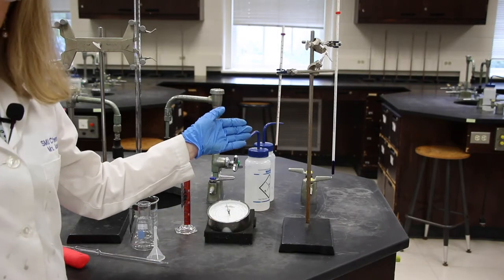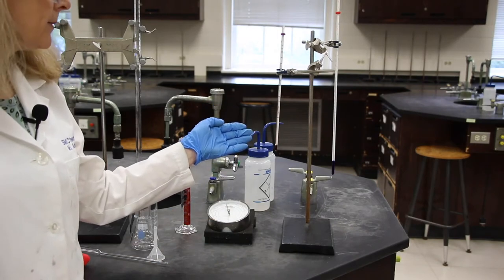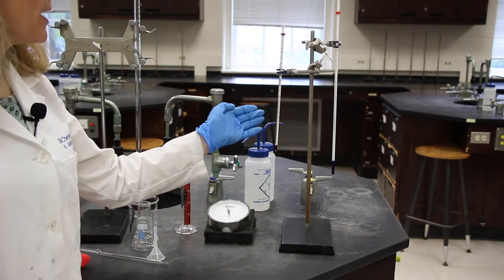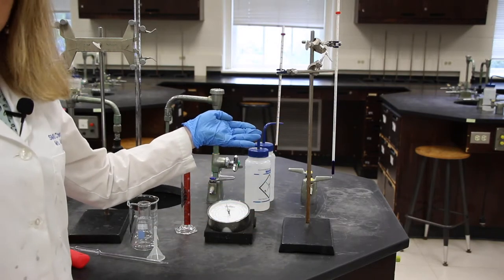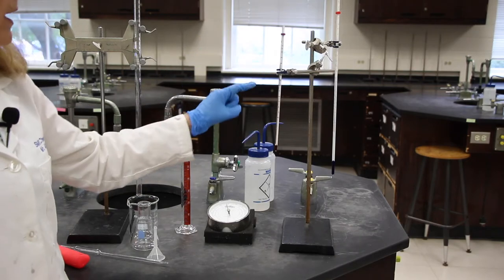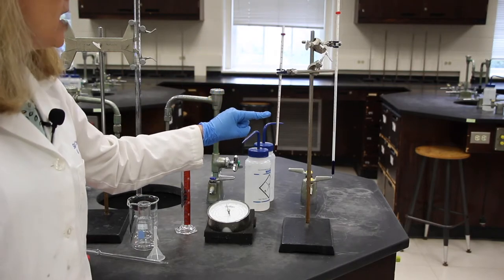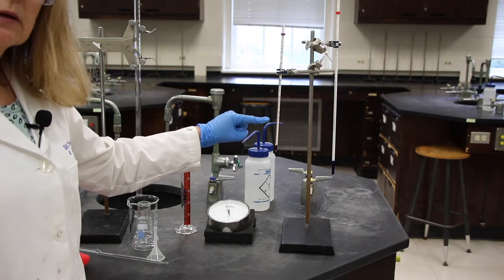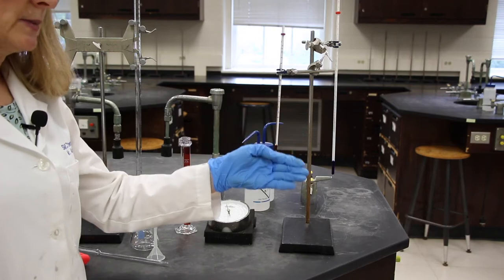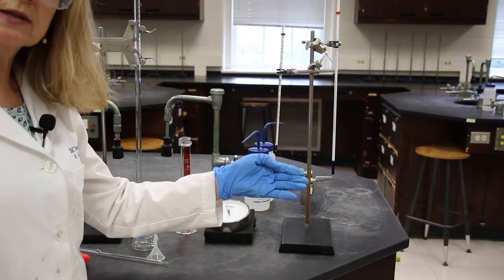The first set of equipment that we're going to learn how to read properly are the thermometers. The first thermometer on the left is from minus 20 to 110 degrees Celsius. If you'll look carefully, the smallest marking is one degree Celsius. So we're going to estimate to the next digit, which is the tenths.